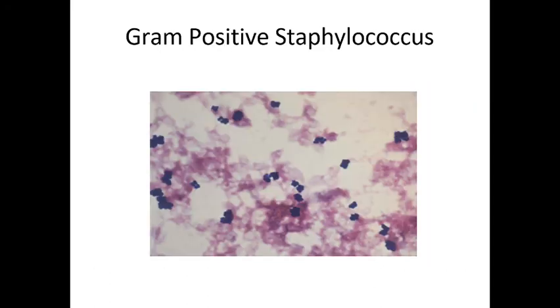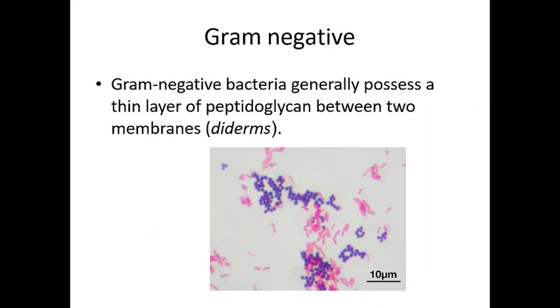This is further gram-positive staphylococcus, and this is the gram-negative bacteria.